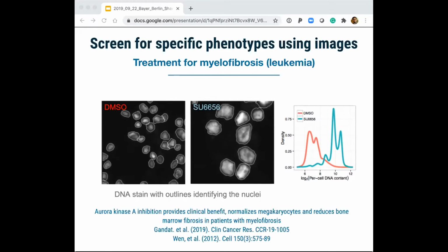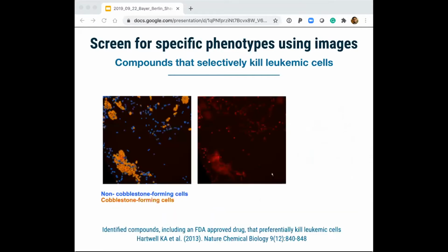We tested them on human patient blood samples, which confirmed that a drug they identified is able to reduce the leukemic content in those isolated samples. This led to a clinical trial starting a few years ago for alisertib in adults with this form of leukemia, and it was reported earlier last year that results looked really promising.